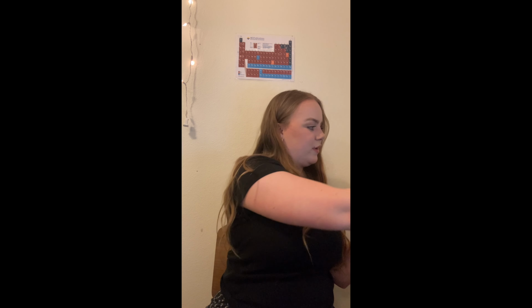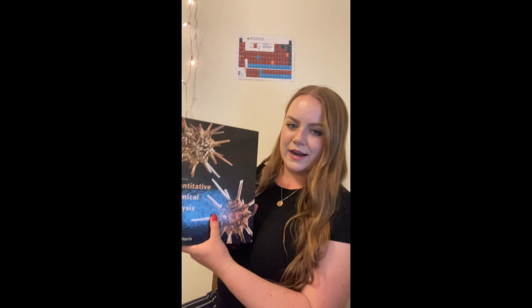I would honestly say, in my opinion, the Pacifica C and C Love serum and the Kiehls serum, which, let's look at the name again. The Kiehls Powerful Strength Line Reducing and Dark Circle Diminishing Vitamin C Eye Serum. Mouthful. But honestly, I feel like that worked. Those two worked the best. I'm very impressed. And shout out to 8th edition Quantitative Chemical Analysis by Daniel C. Harris for assisting us with today's experiment.